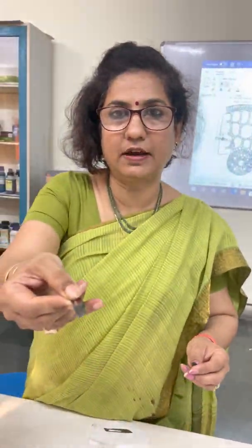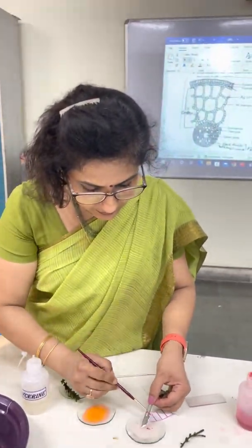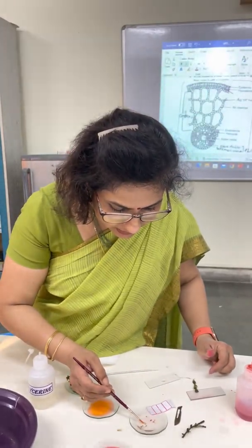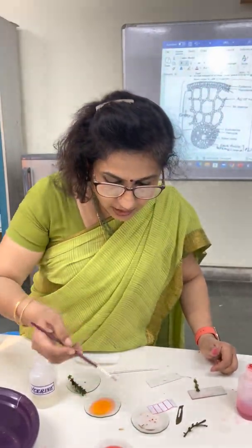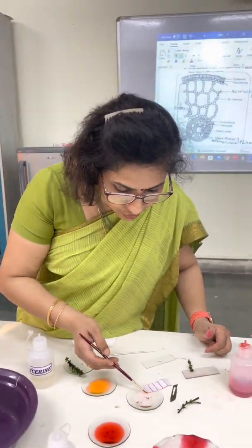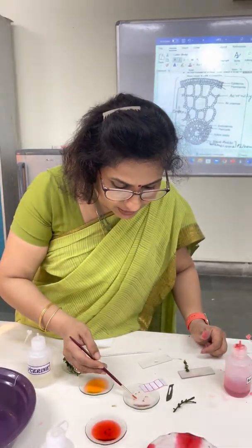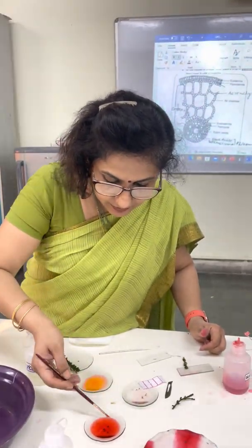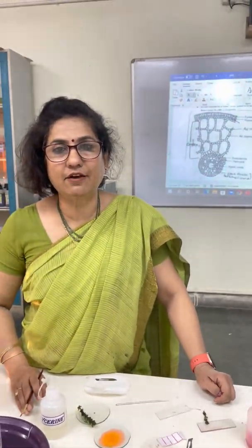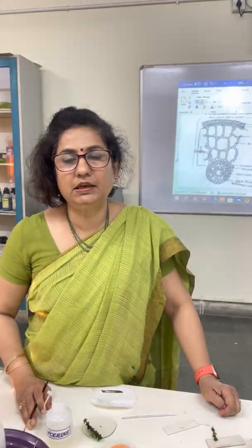I have cut 4-5 pieces. Now I transfer them into water, and select 2-3 thin pieces and transfer them into another watch glass in which I have taken water and 2-3 drops of safranin.